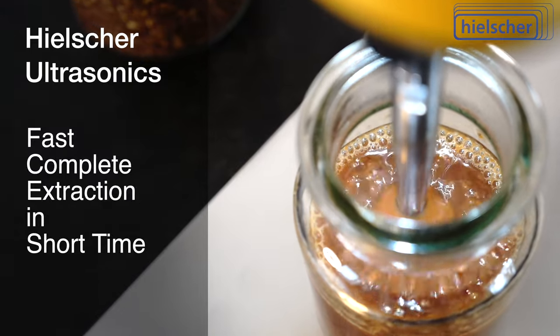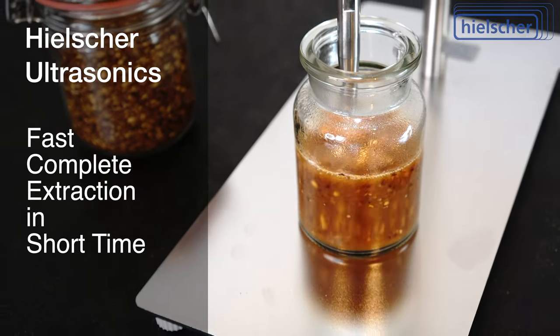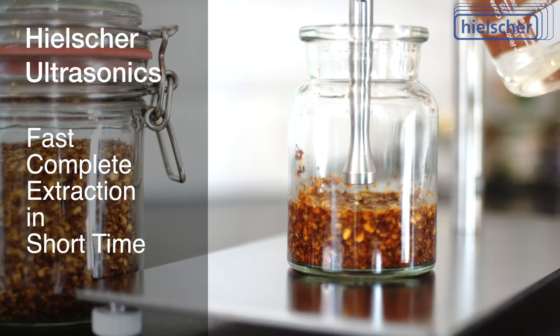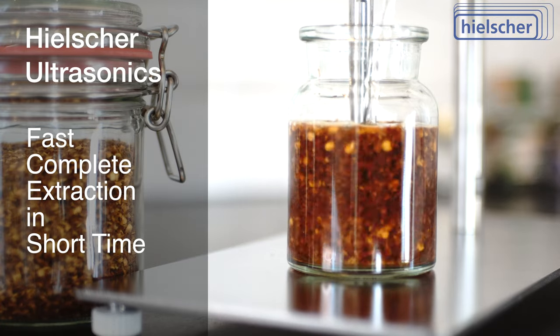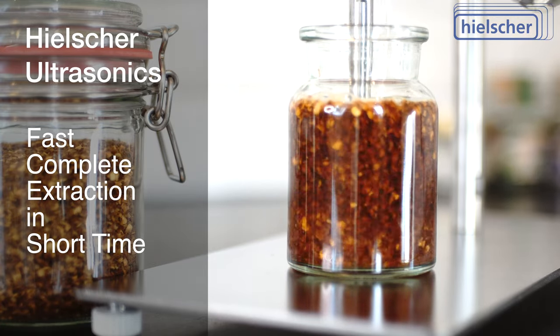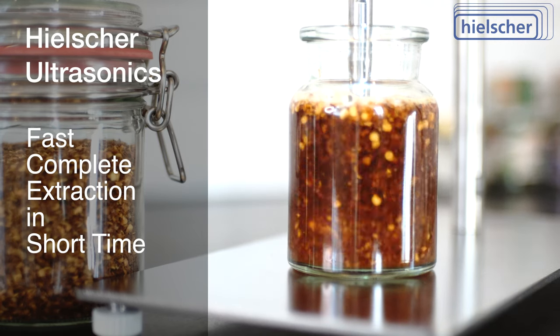The ultrasound travels deep into the particles and enables a particularly effective and complete extraction. Due to the purely mechanical effects of the ultrasonic waves, sensitive aroma substances are extracted particularly gently. The results are high-quality, non-thermal extracts in a very short time.